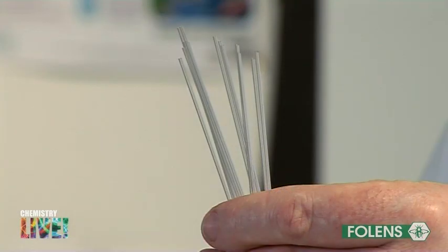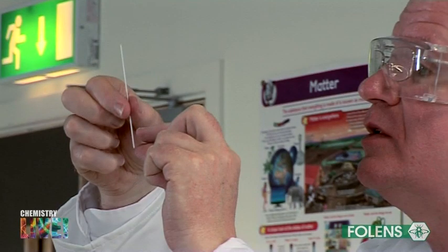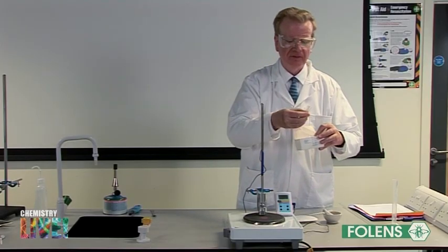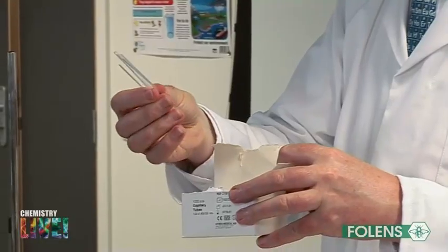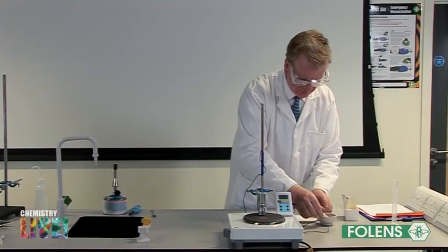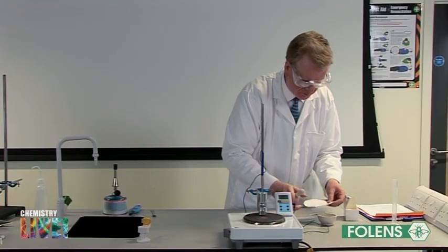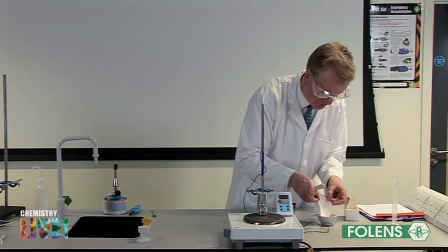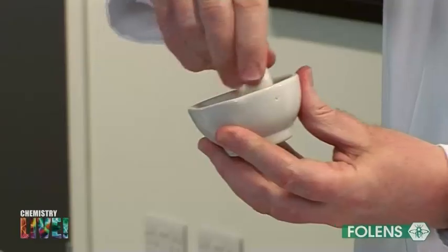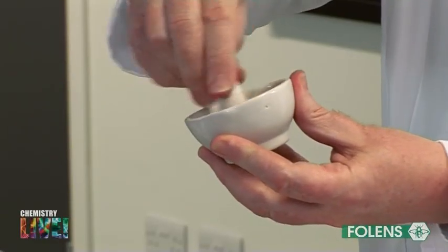To measure the melting point of the crystals, we place them in a very narrow glass tube called a capillary tube. To help them fit in the tube, we grind up the crystals. A pestle and mortar is used to grind up the crystals.